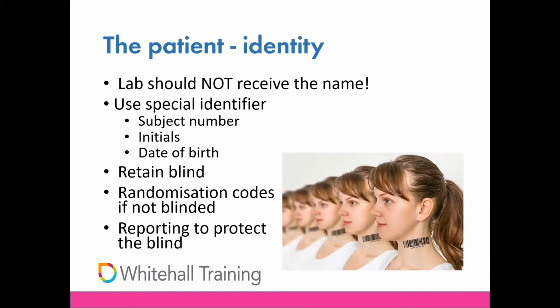However, labs are sometimes unblinded, for example, for pharmacokinetic analysis. In this example, it's common not to analyze samples from subjects on the placebo, and so analysts may be provided with a randomization list in order to select the correct samples for analysis. There should then be a recognized process to deal with this whilst protecting the integrity of the entire study. Patient identity needs to be kept from others in the lab, so randomization codes must be stored and adequately controlled to ensure they can't be inadvertently seen by anyone else.